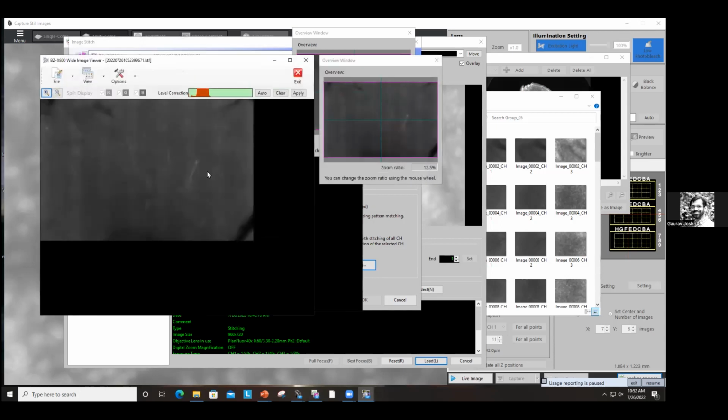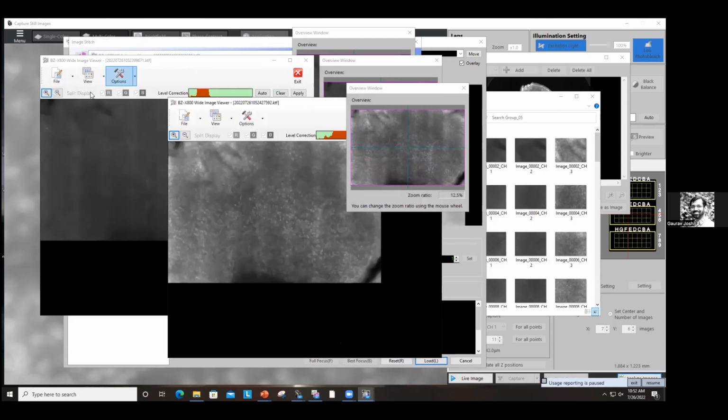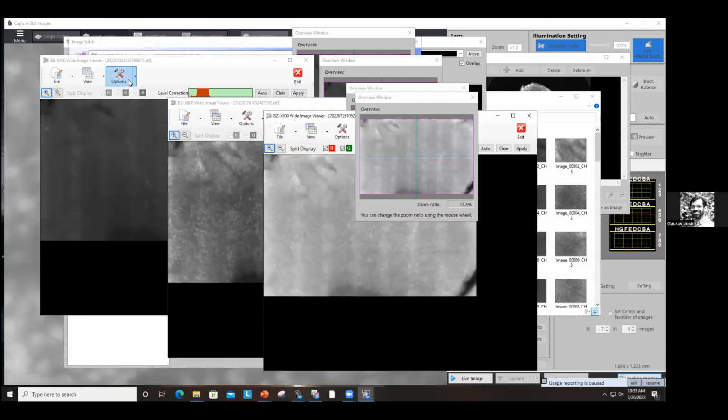Since our nuclei were at very low intensity, we are getting the shading effects, which usually is not a problem if your images are bright enough. So what you saw is we got 4 images. The first 3 images look perfectly fine, and this is in sequential order of your channels. So DAPI, FITC, TRITC, and the 4th channel is a merge of all of them, which we don't care about.